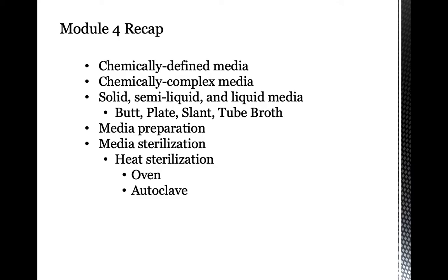Now, if you want to observe motility, a good type of medium is semi-solid medium. Then for liquid media, if you want to increase the number of cells of your pure culture, you grow them in broth. It's easier. Most microbes will find it easier to actually suspend themselves in a liquid matrix where the nutrient is very rich. The nutrient concentration is very high.